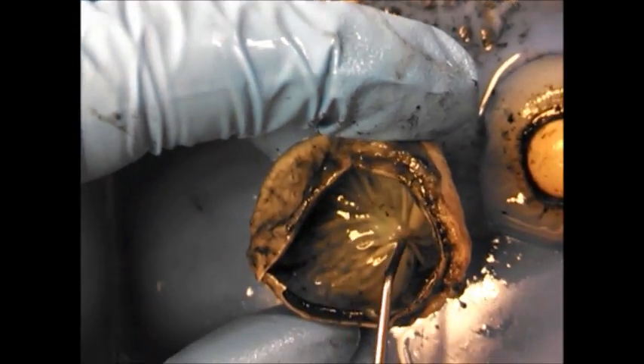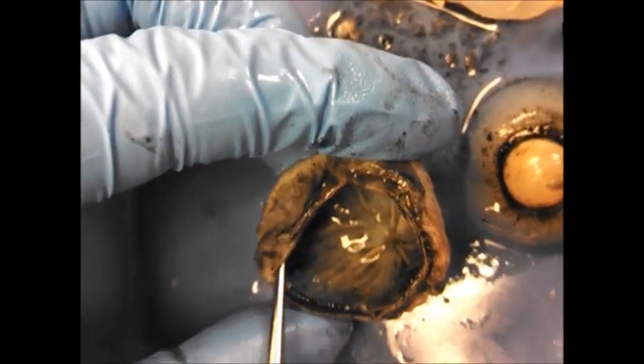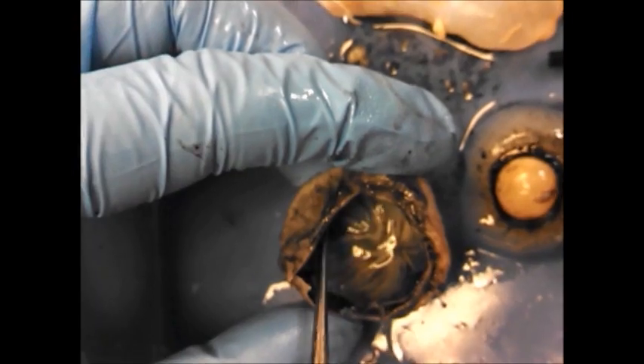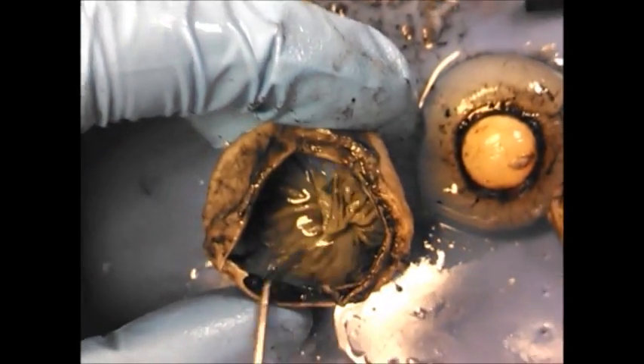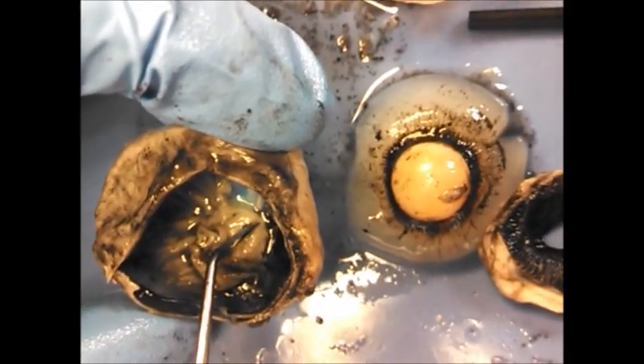The optic disc is where all the tissue pulls to here — where all the little fibers from the retina run out to go through the optic nerve on the back. Sometimes you'll see the retina pulled back like this, but it will still be connected here to the optic disc.